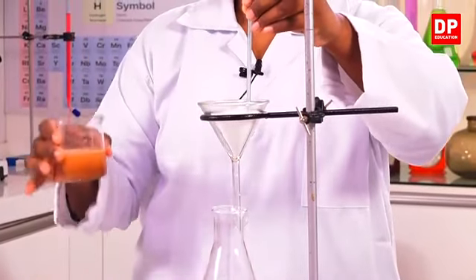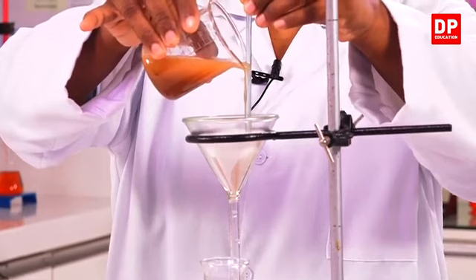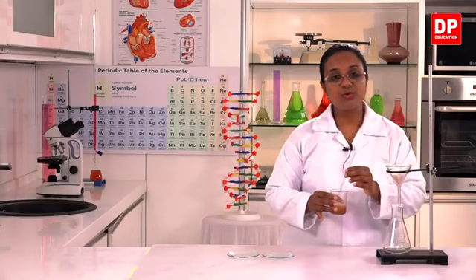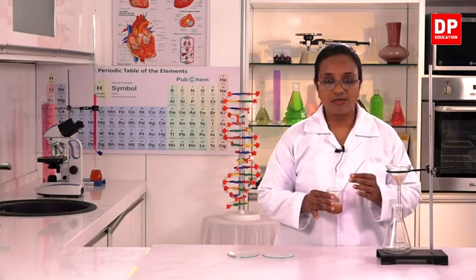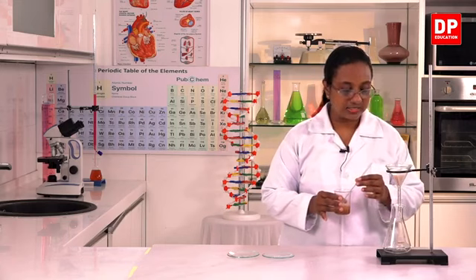If we hold the glass rod this way and pour the solution along the glass rod, we make sure that the solution doesn't spill. And also when doing this process, we shouldn't pour all the solution into the funnel. Little by little, we have to transfer the solution so that it gets filtered properly.